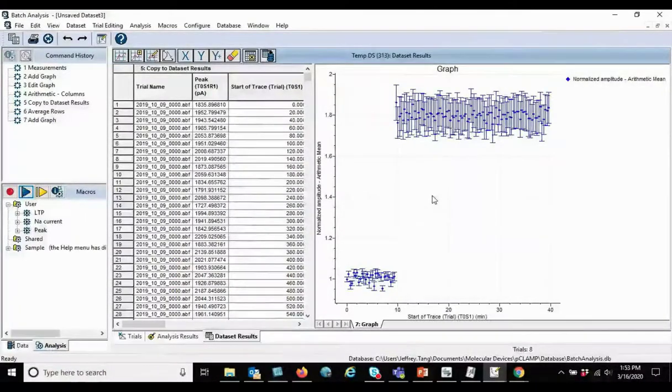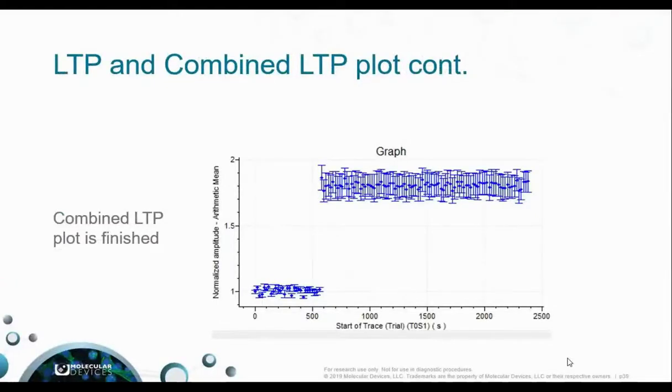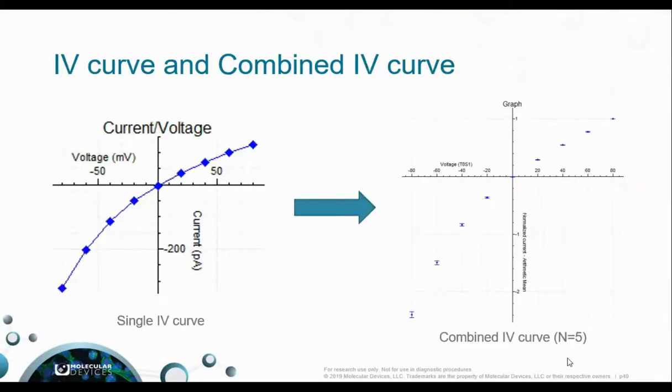So in this demonstration, I showed you how to put 8 LTP curves and combine them as one LTP curve with the standard error bar. All right. Then let me go back to my next demonstration. Okay, let me go back to my slides.